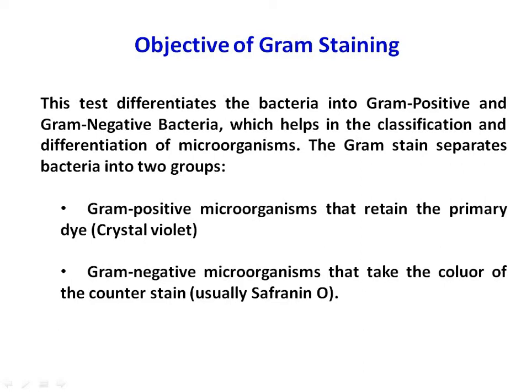If the slide is examined at this point, all the cells would be deeply stained and appear blue-purple. Then 95% ethyl alcohol is applied and renewed until all but the thickest part of the smear have ceased to give off the dye. The differential feature of the stain now becomes apparent.